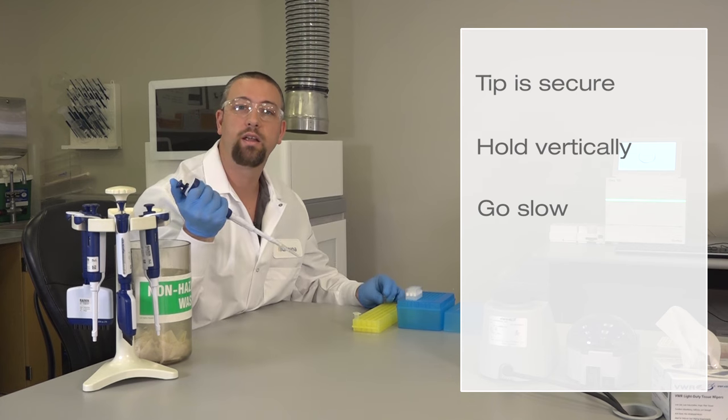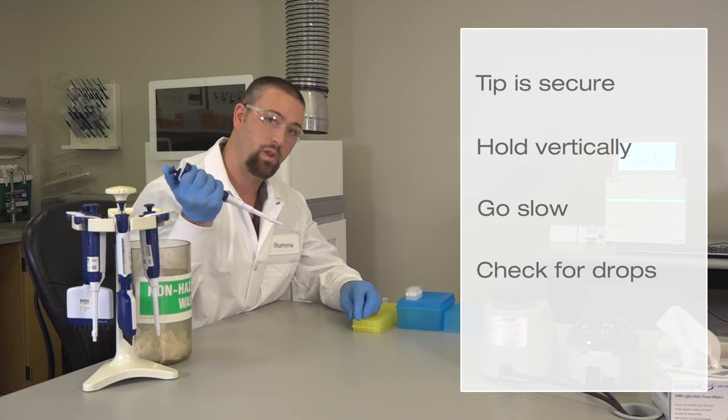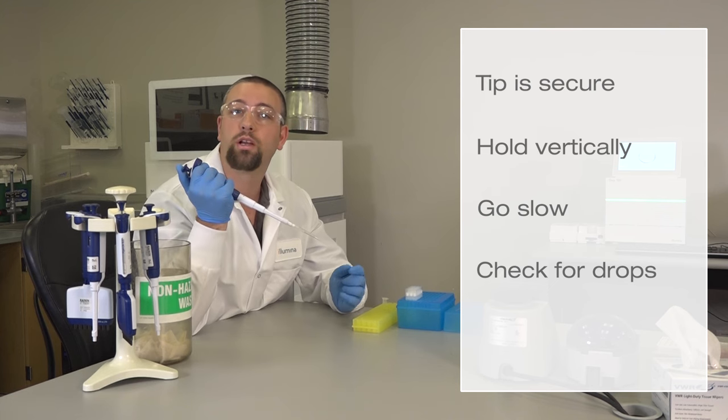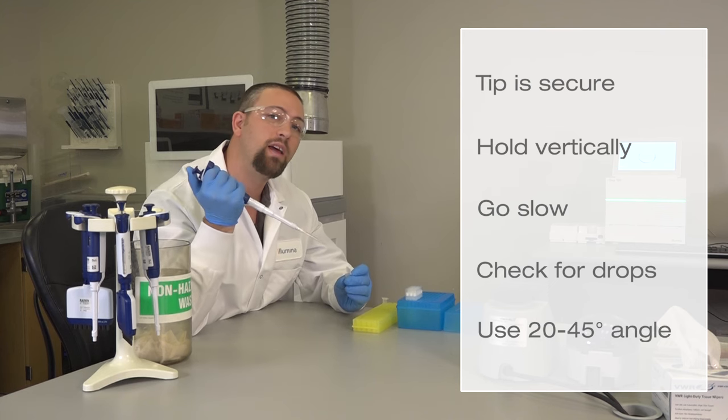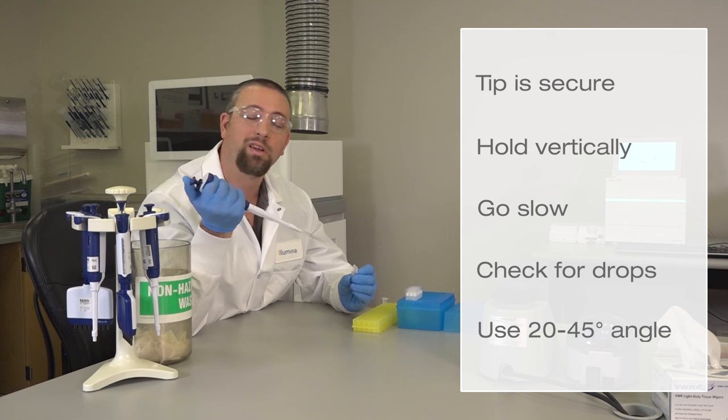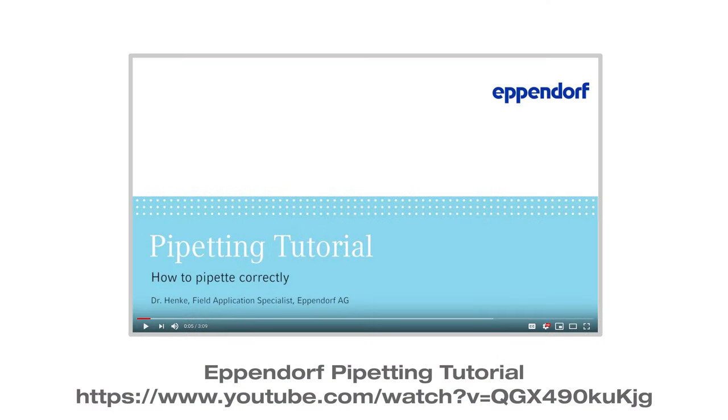Check the outside of the tip for unexpected drops of liquid. And hold the pipetter at a 20 to 45 degree angle to achieve the optimal flow of liquid out of the tip and avoid splashing. Here is an online video for more on proper pipetting.